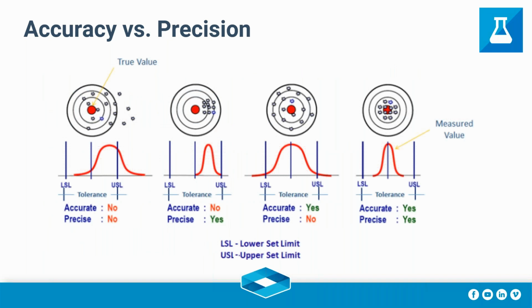When we speak about accuracy versus precision, there's a subtle difference here, which, for those who work with QA/QC on a day-to-day basis, is obvious. But for completeness' sake, and for those who are not familiar with the concept, a simple diagram would help. What we're aiming to do in the laboratory is to have our test work of high accuracy and high precision.